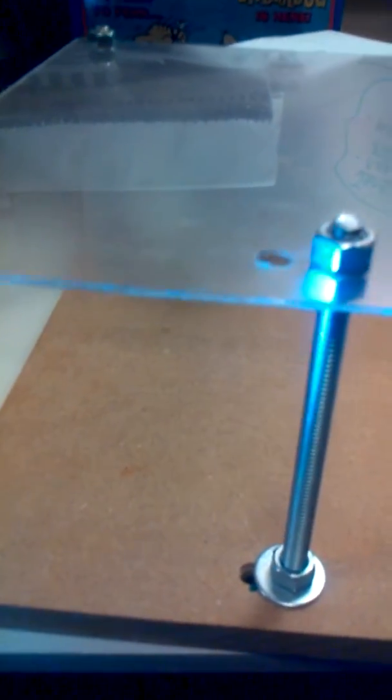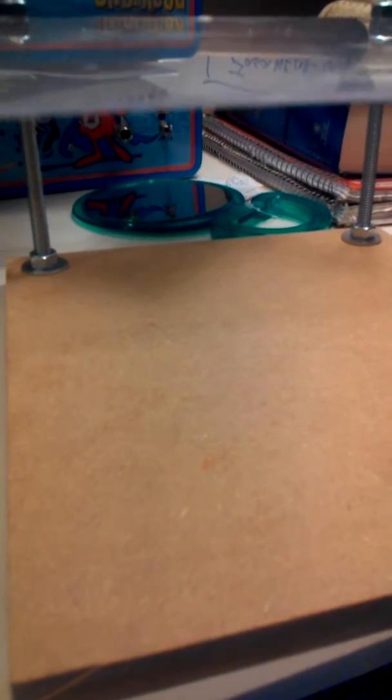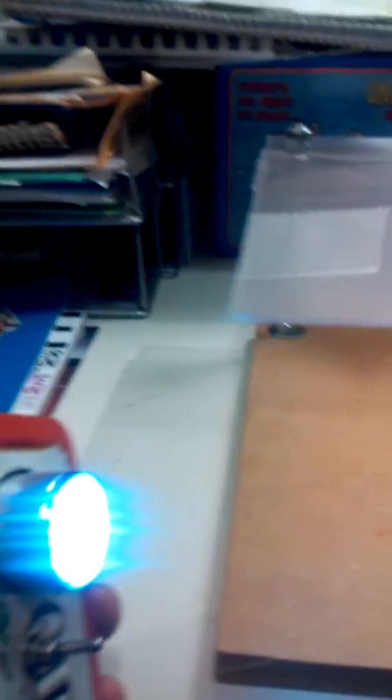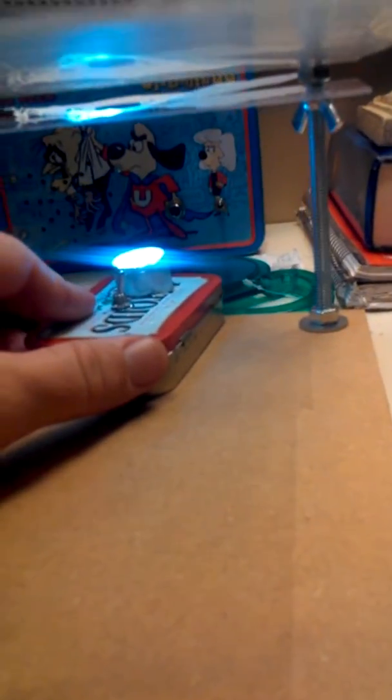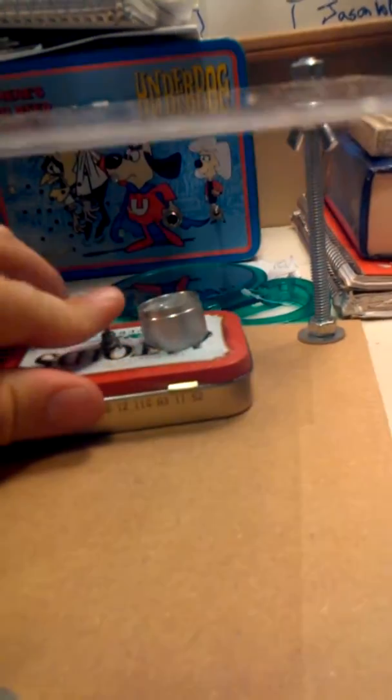And most microscopes have a light down there to backlight specimens. But I just built an Altoids flashlight that I can put under here like this and move it around. Then I'll switch it on.